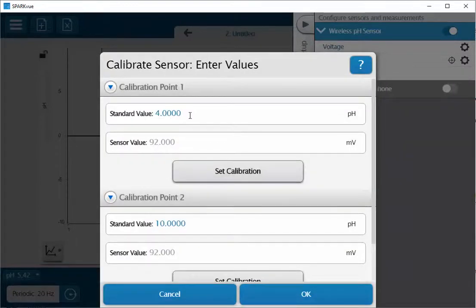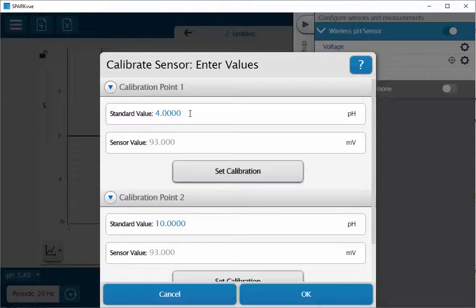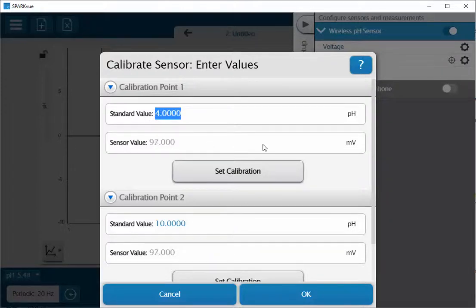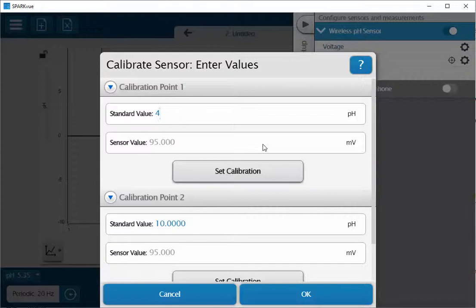By default, the standard value that's listed first is a pH 4. That's actually the type of pH buffer solution that I have, but if you wish to change it you can highlight this and place in a different value depending on what the buffer solution is that you have. Again, the buffer solution that I have is a 4 buffer solution, so I'll enter that in there.